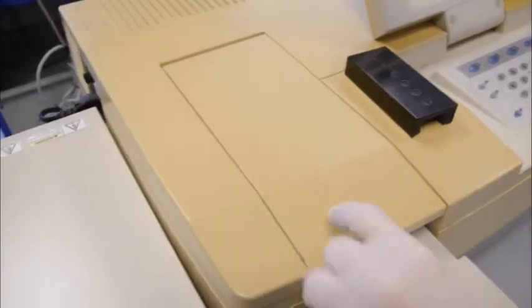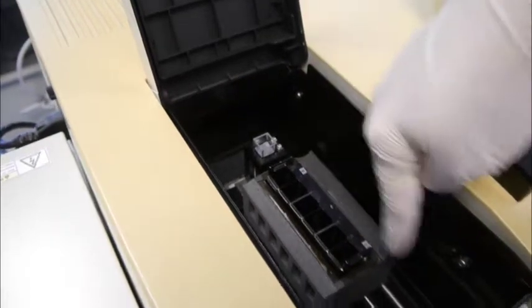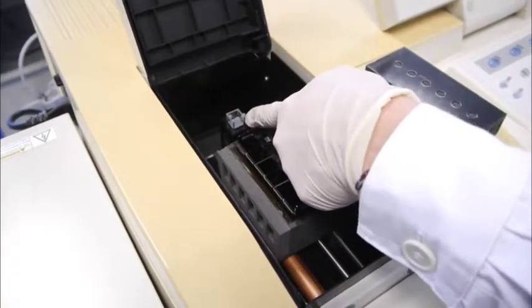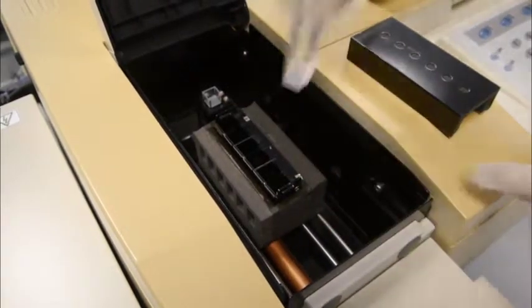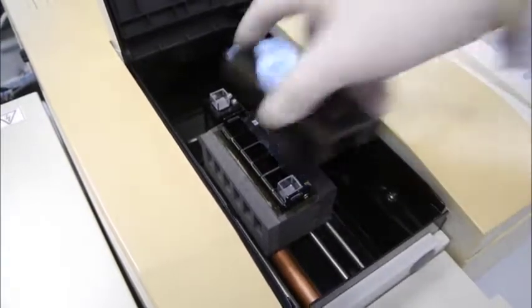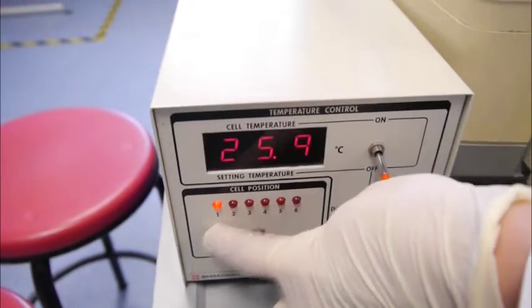Wipe the cuvette and then we will place it in the reference sample holder. This is the reference sample holder and these are the sample holders. After you have placed your reference blank — the RO water — to the reference blank holder, you also have to place another RO water blank on sample holder number 1. After you cap this and close this cover, ensure that the light is actually toggled to sample cell 1.